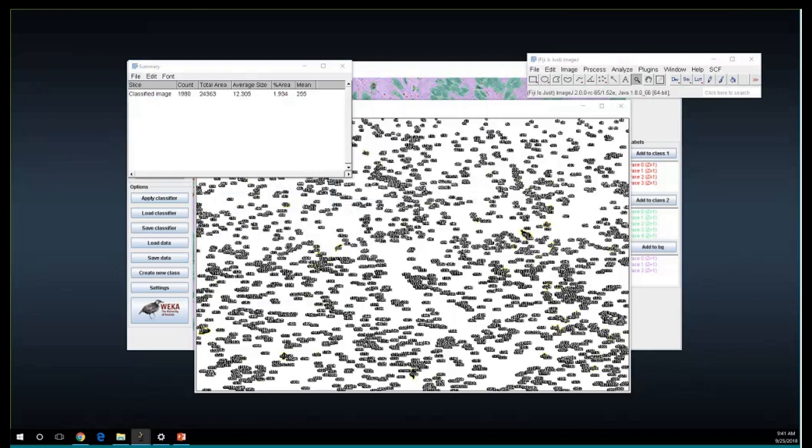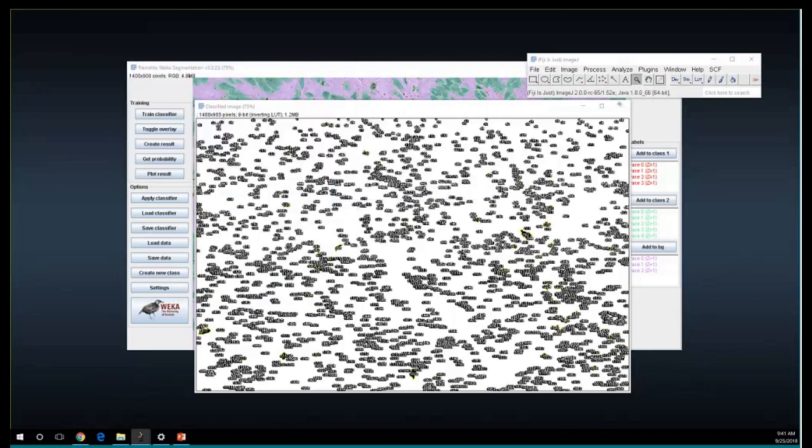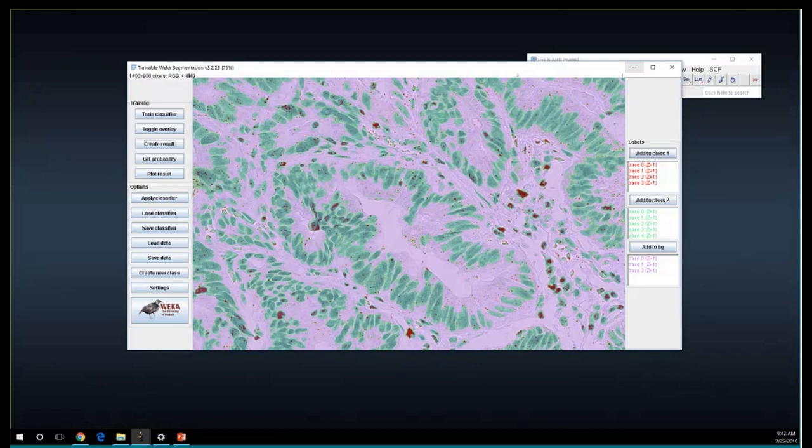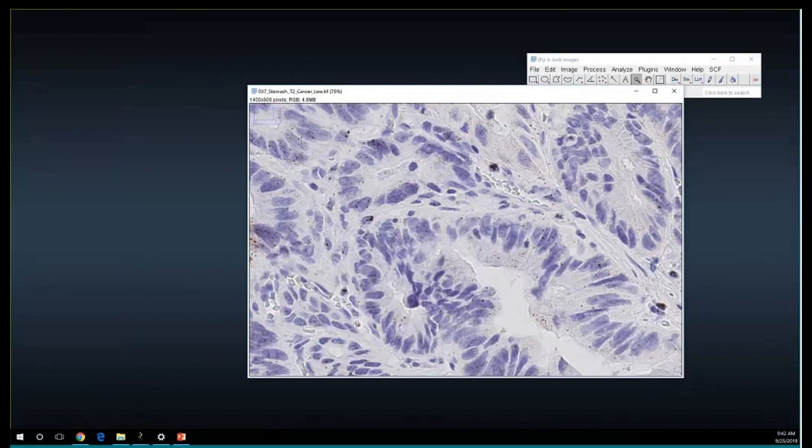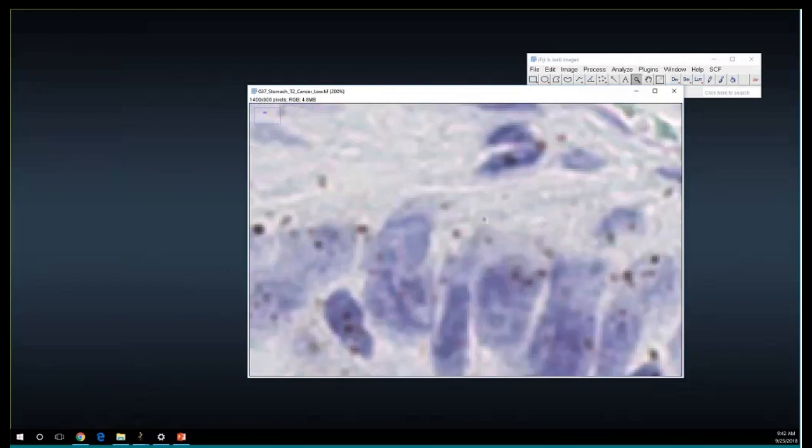And let's open the image again, just to show you what I'm doing. You close all this. So that's my image. You want to zoom in and find single dots and estimate how many pixels. Then let's say this is one dot. You can see there is almost 3 by 3 pixels for this dot. And that tells you there's 9 pixels for the dot. You're going to take this number and process your Excel sheet to reflect this.